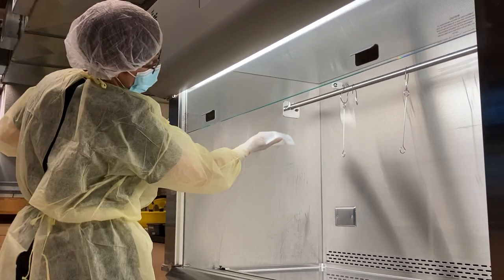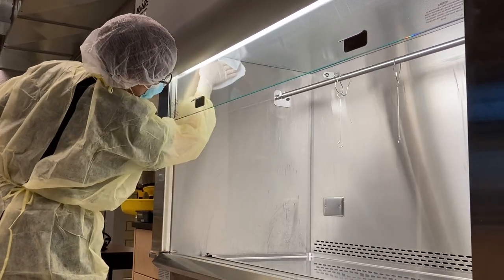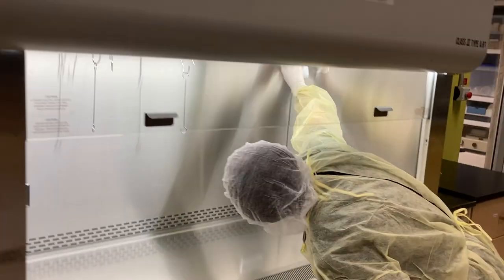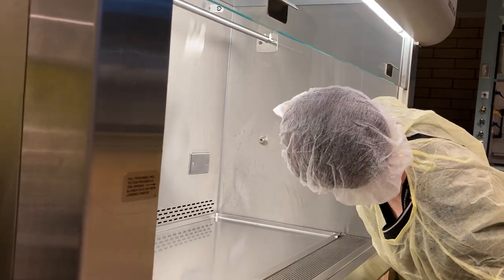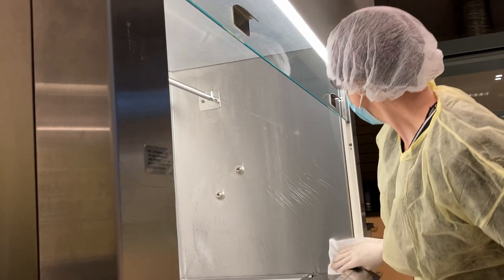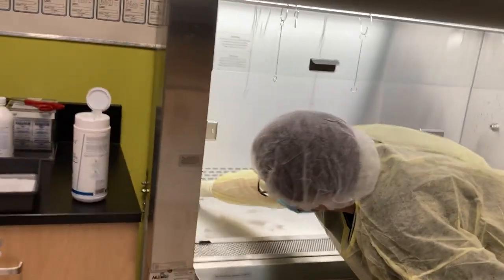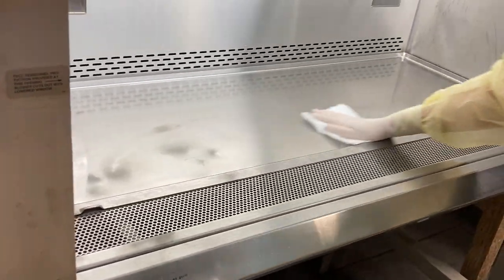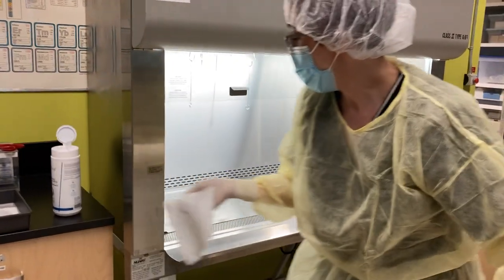Now we're going to use method B and clean the side cloth from top to bottom, and the other side cloth. Going to do the work surface, back to front, side to side, again slightly overlapping. And again, a new cloth for the front row.